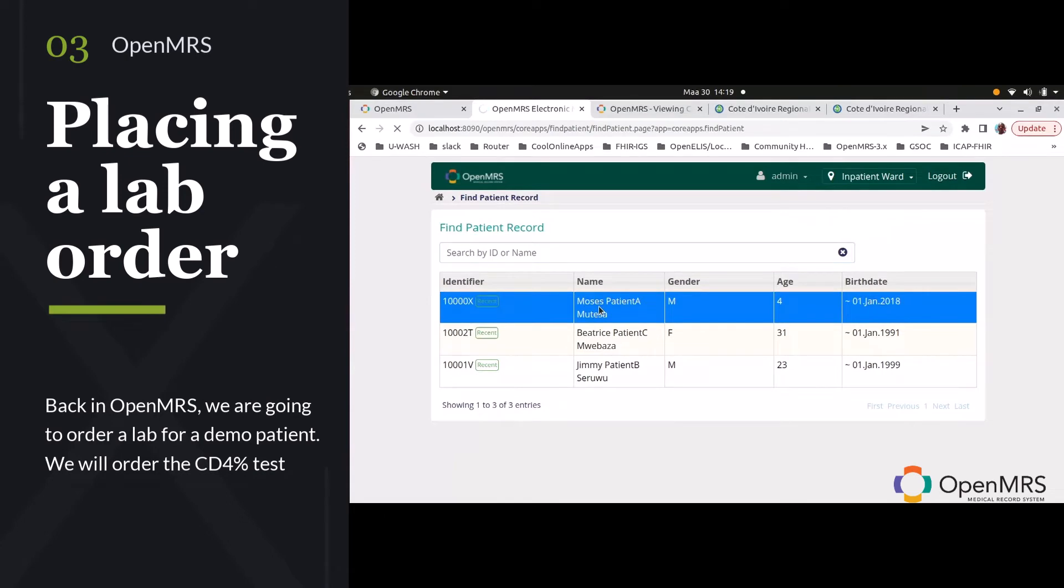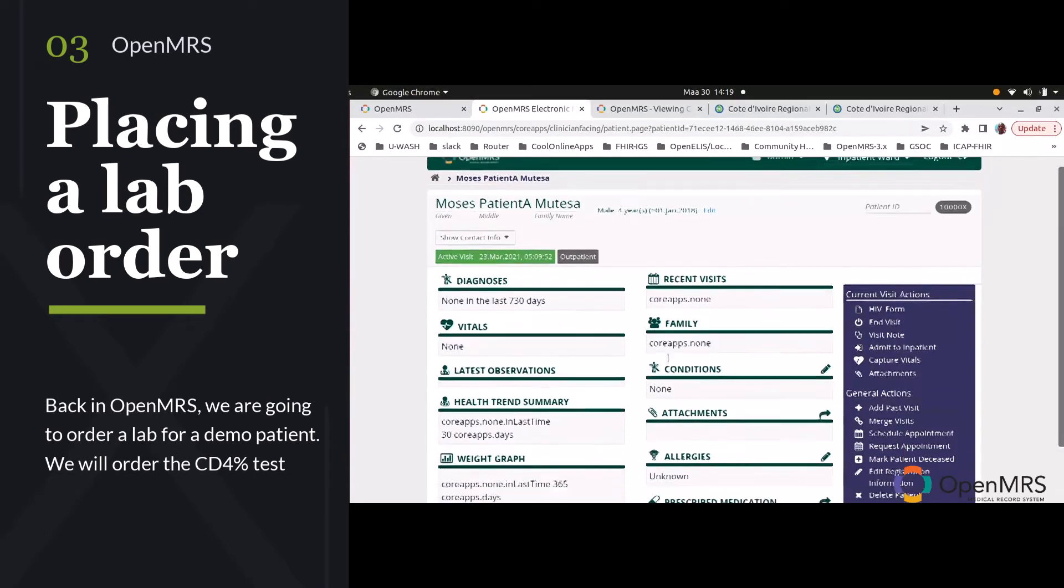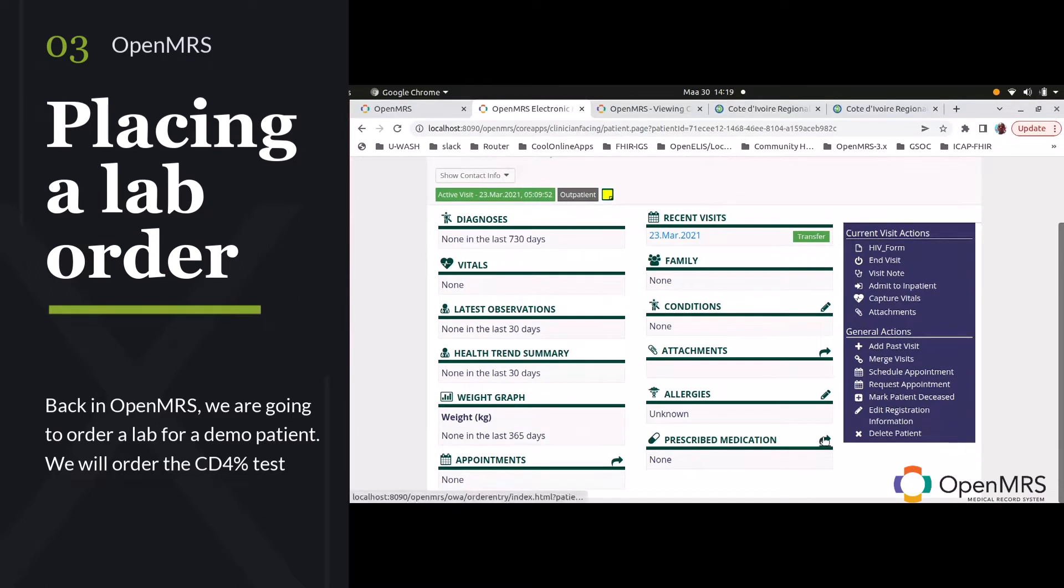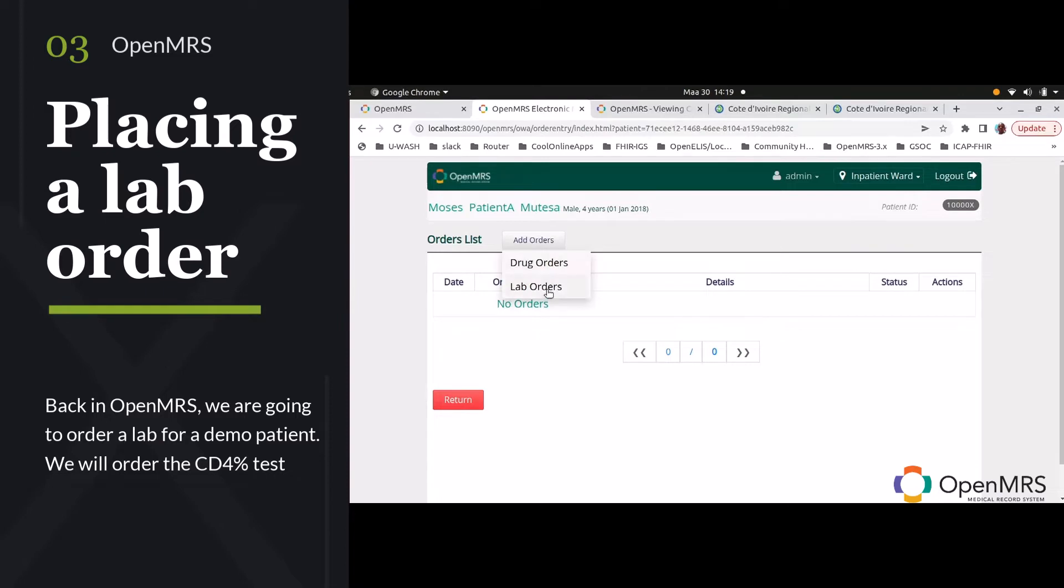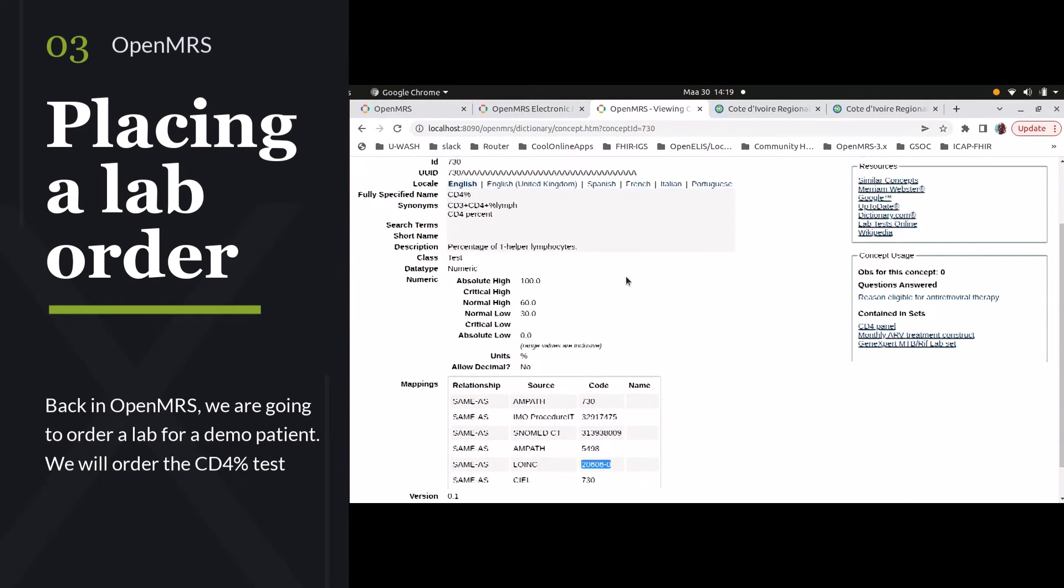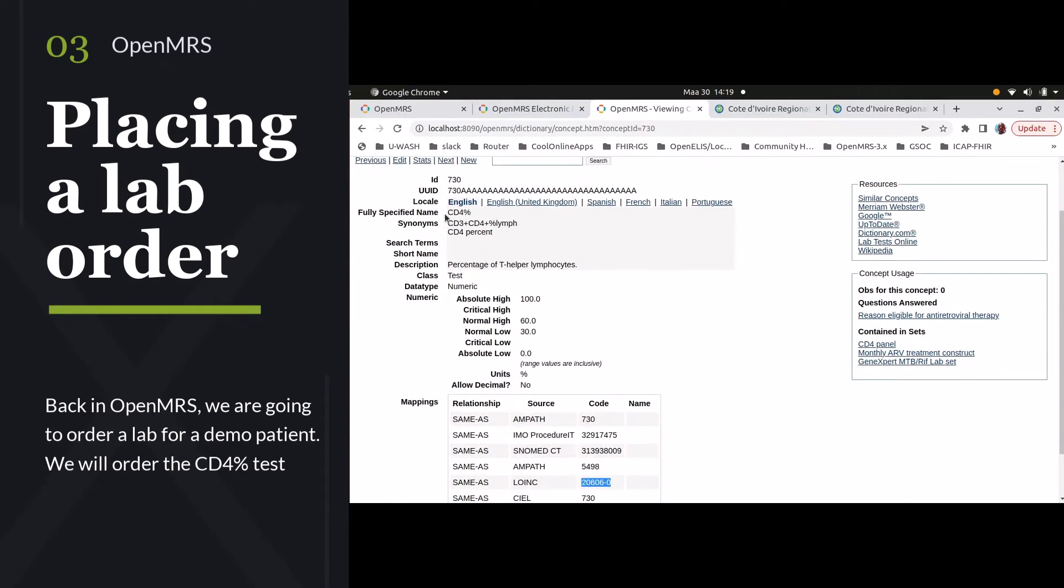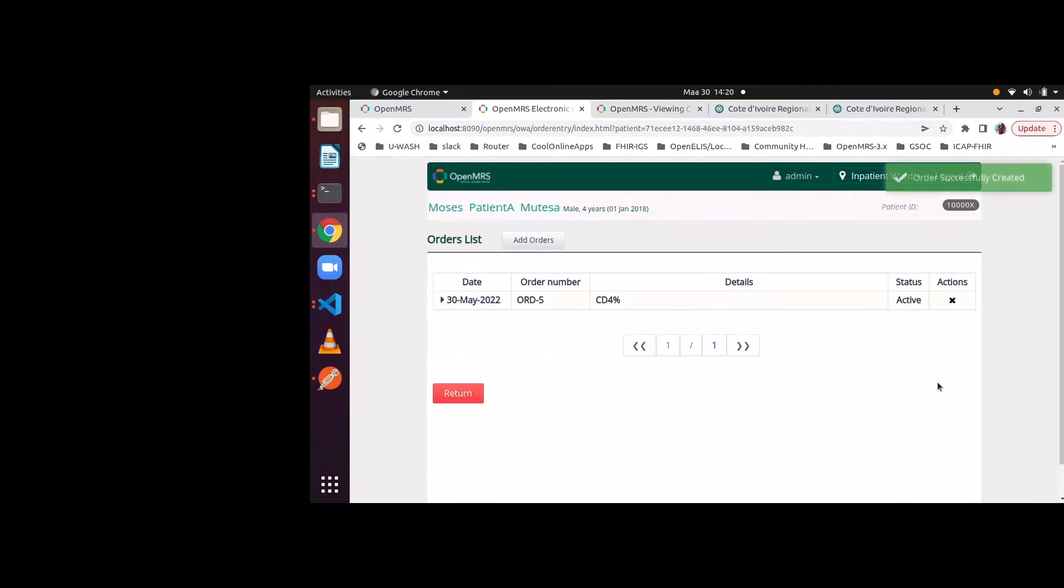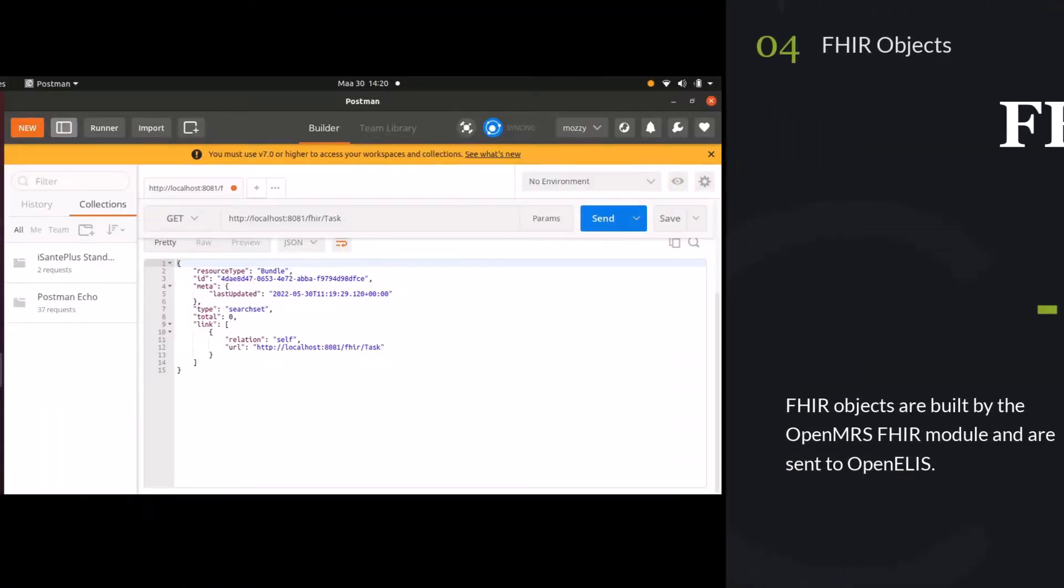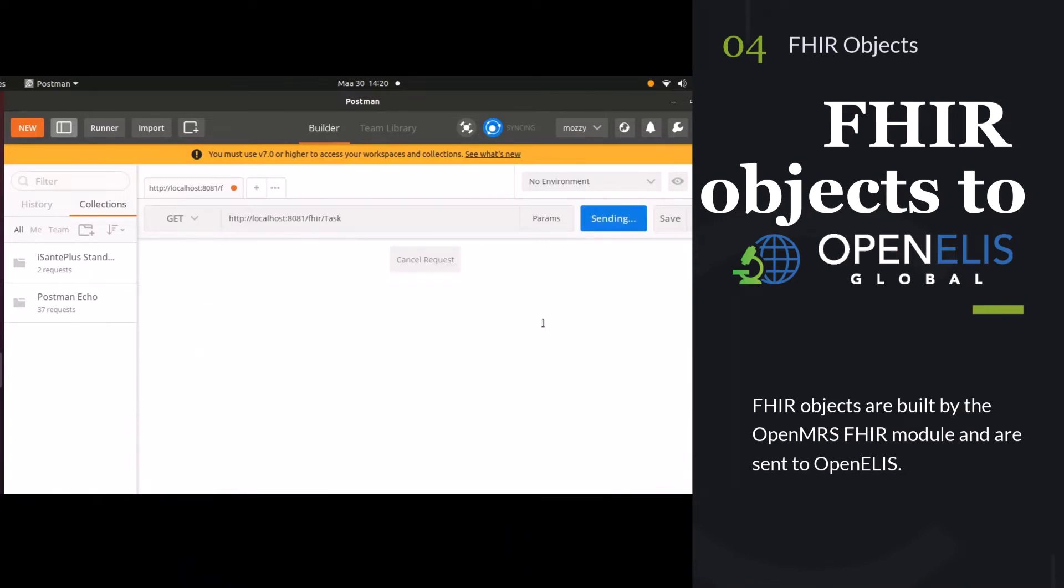Next, we are going to place a lab order for a test patient in OpenMRS. So we have opened up our patient record. We're going to select that CD4 count as we showed before, and here you can see the concept for that. We're going to order this CD4% test, and next we are going to see what OpenMRS sends to OpenELIS.